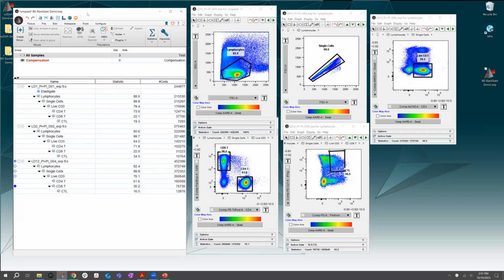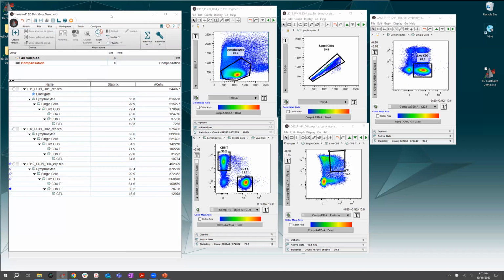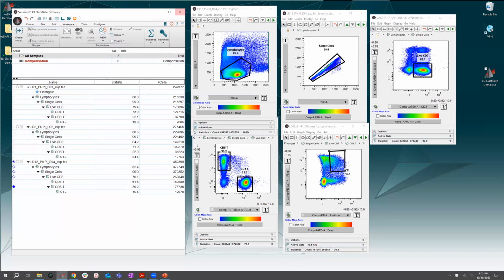I think also, as we go with the flow cytometry experiments, the training sample that I pick on one workspace, when I go to a new workspace, may not model the shifts that were captured at that particular time in acquisition. So maybe I'd want to pick a training sample in that workspace because it was acquired more recently and it might match the rest of the samples better. But maybe that's just a matter of personal taste. I imagine you could turn it into a template if you drag it to the group. But in terms of using it over and over, I myself would probably just pick a new template to run it on in new workspaces. But yeah, it's a good question.